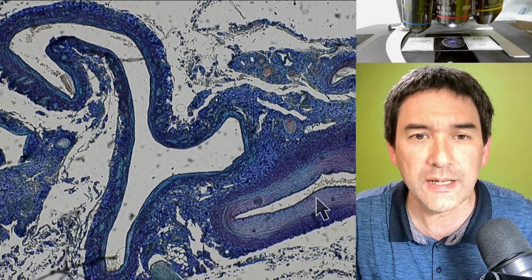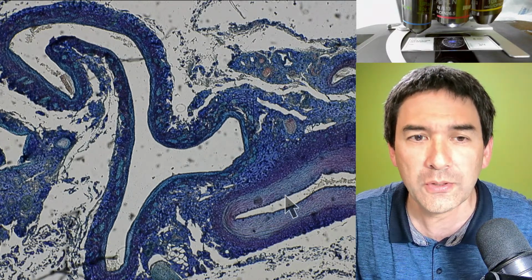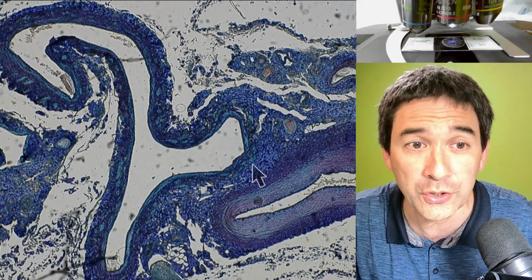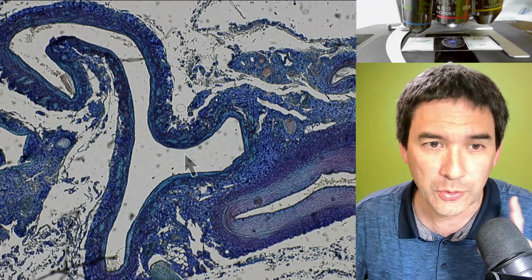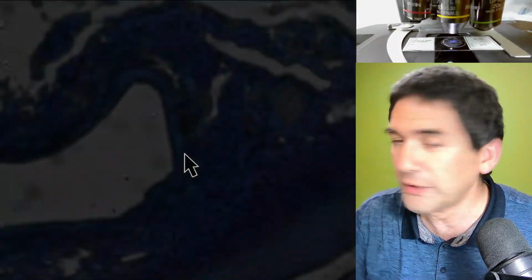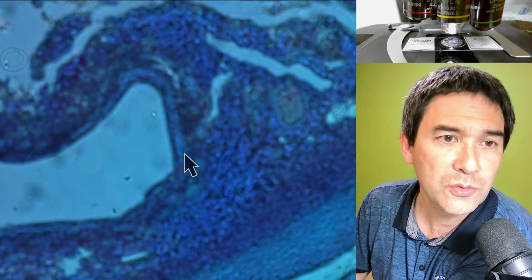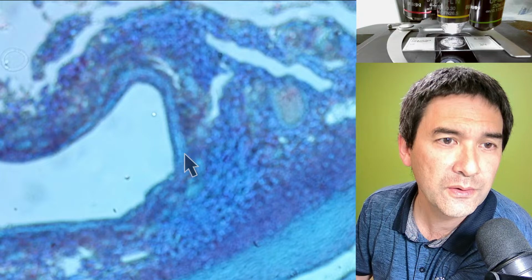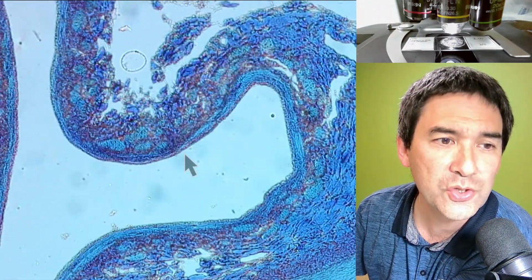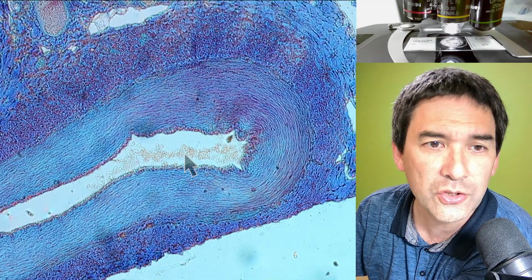And this one down here, that is the cross-section of an artery, and you see already that the artery has a much thicker wall, because arteries have to withstand a larger blood pressure, because arteries carry blood away from the heart and veins carry blood to the heart. But we talk about the blood, and the reason why I show this to you is because I did find a few red blood cells here as well. I have to go up a little bit again with the magnification and also the brightness. Here we're zooming in. Here is the artery again.